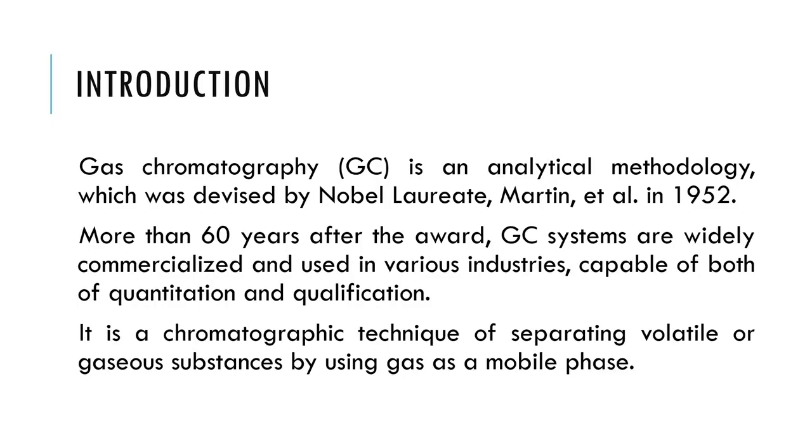So, coming to the introduction, we know that gas chromatography is a technique of separating volatile gaseous substances by using a gas as a mobile phase. Gas chromatography is an analytical methodology invented by the Nobel laureate Martin in the year 1952. Since its development, there have been numerous improvements in the GC for various industrial applications, for its quantification and qualification.